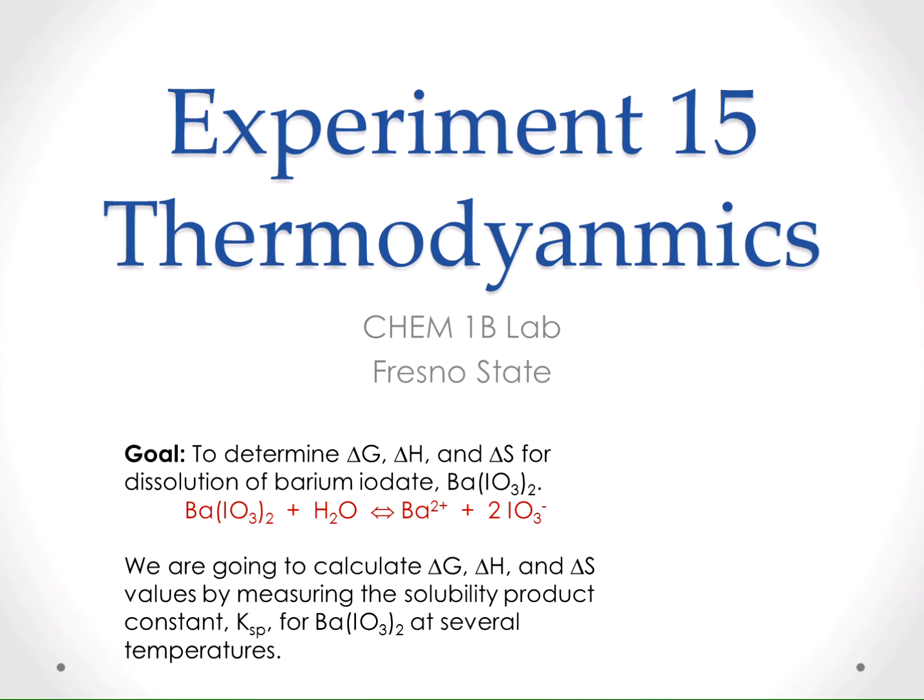This is the pre-lab lecture video for experiment 15, where we're going to be looking at thermodynamics. In this lab we're going to be determining the delta G, the delta H, and the delta S for the dissolution of barium iodate. So we're going to be measuring the free energy change, the change in enthalpy, and the change in entropy for dissolving barium iodate. The reaction of barium iodate dissolving is shown here, where it breaks up into barium 2+ and 2 equivalents of the iodate ion.